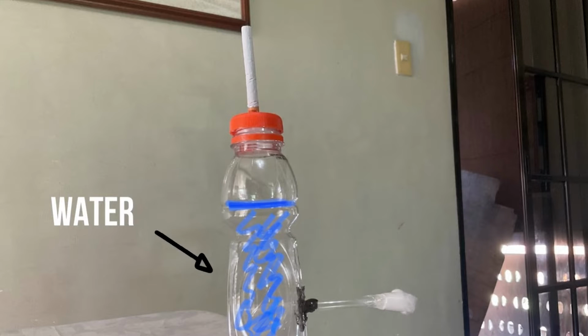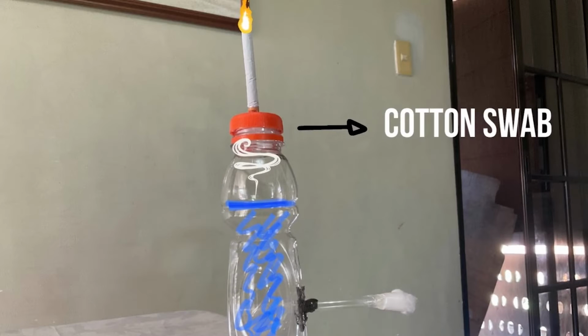To conduct the analysis of the chemical components contained by the cigarette smoke, the improvised smoking machine was filled with water. As you light the cigarette, the smoke, as it moves into the container, will move up upon contact with the water. Therefore, the smoke comes in contact with the cotton swab found on the bottle cap of the container. This cotton swab, after the cigarette stick was completely consumed, now contains the various chemical components that the cigarette smoke contains, like tar and nicotine, that will be analyzed further.